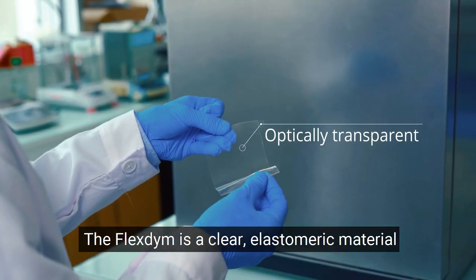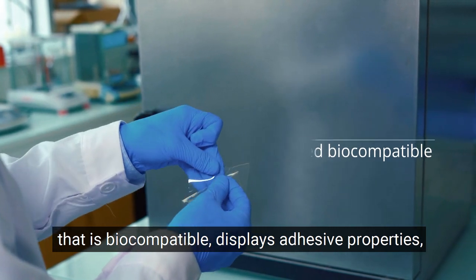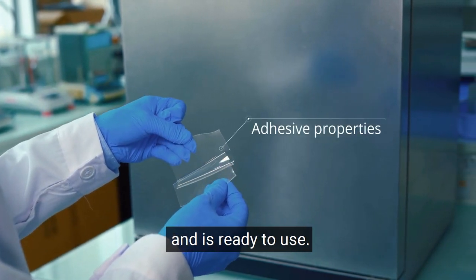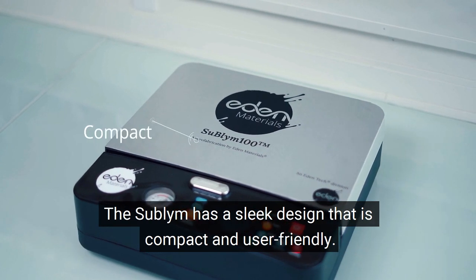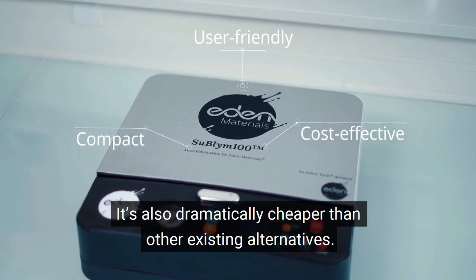The Flexdym is a clear elastomeric material that is biocompatible, displays adhesive properties and is ready to use. The SuBlym has a sleek design that is compact and user friendly. It is also dramatically cheaper than other existing alternatives.